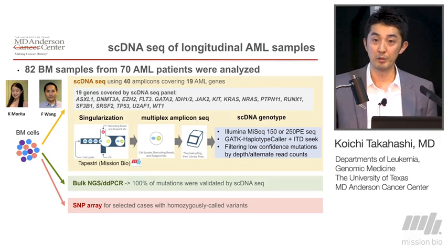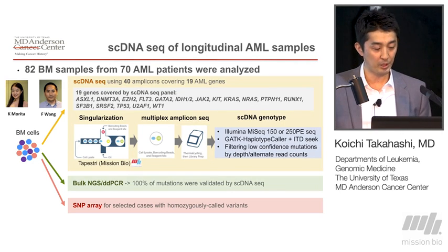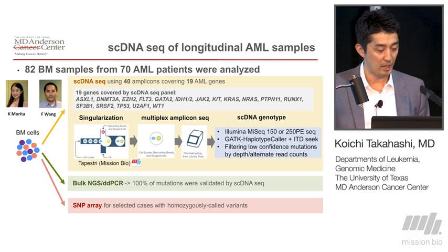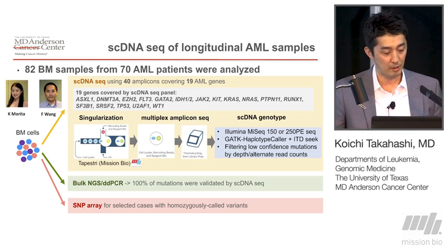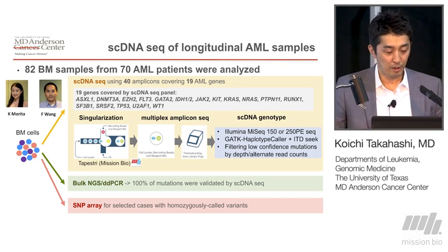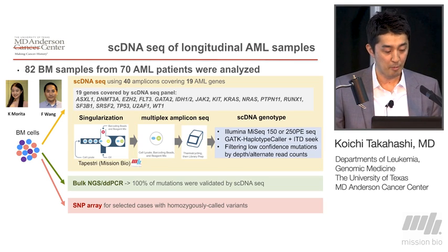Since we were very happy with this pilot collaboration, we expanded this effort to larger-scale sequencing data. Most of this work was done by two postdocs in my lab, Dr. Morita and Dr. Wang, who performed the bioinformatic part. So far, we have finished sequencing about 70 AML patients with this Tapestri platform.